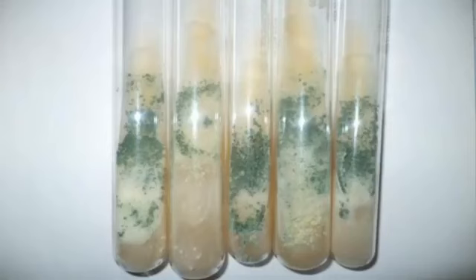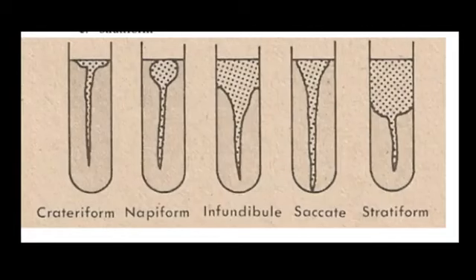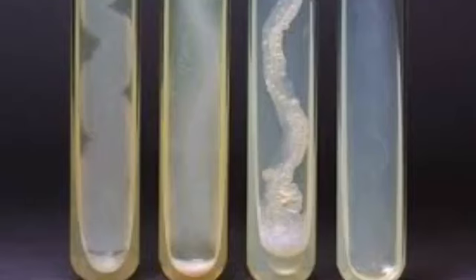Odor. Last is its liquefaction. It could be crateriform, napiform, infundibuliform, saccate, and stratiform. These are some examples of liquefaction.